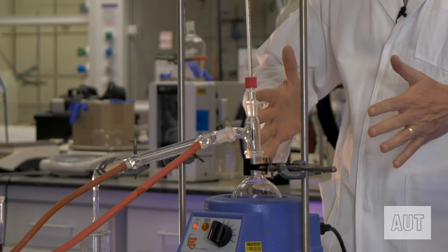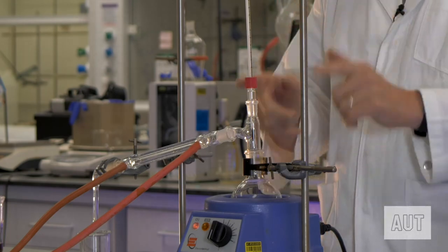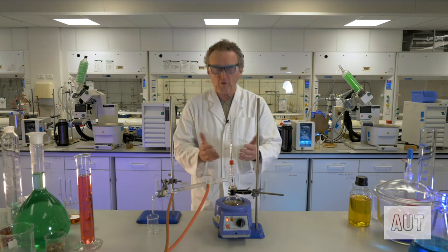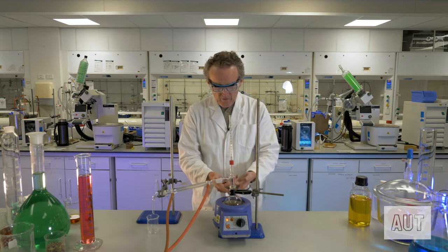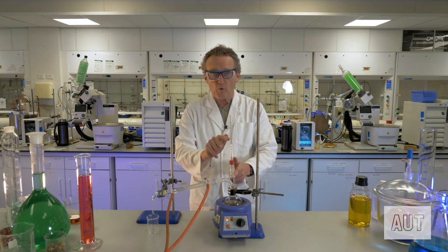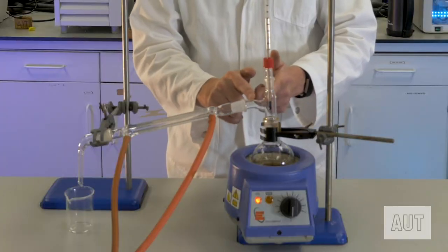Let's talk through what's going to happen here so that you've got some idea of what to look out for. We've got a liquid in here, we're going to heat that up to boiling. And when it boils, what happens? It turns into a vapor. So the vapor is going to come up here, and it's going to hit the thermometer. That's going to give us the boiling temperature of this liquid. And then it's going to travel down the condenser.